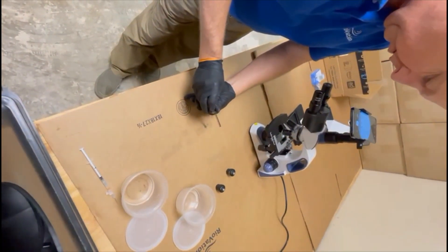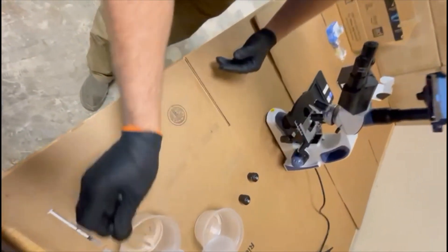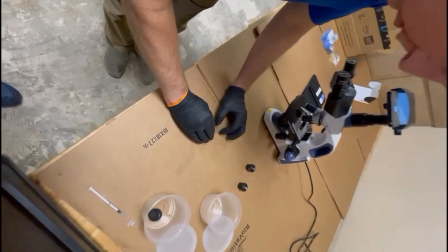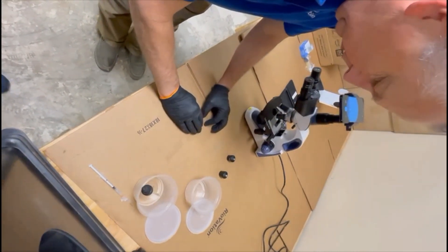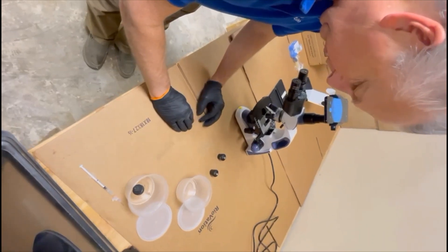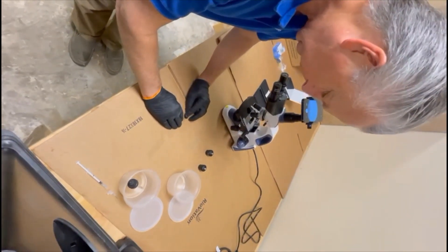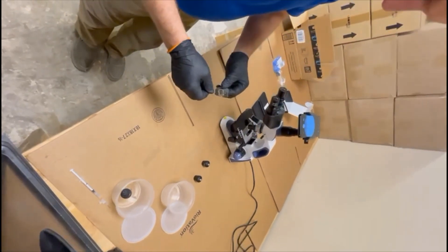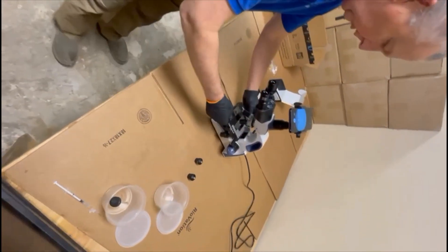Put a sample of that on our slide and then put the cover slip on it. We've got the Vaseline. I have a little dam so that it keeps some of it in suspension instead of smashing it out completely. There should be plenty of material in there.